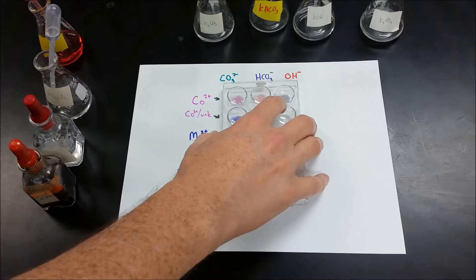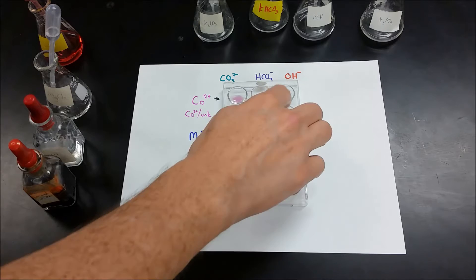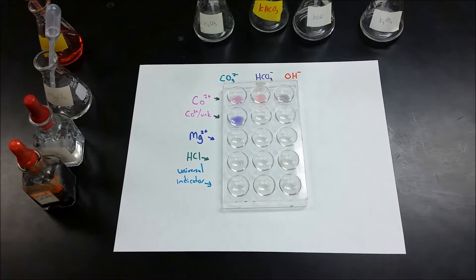So the hydroxide gives a certain color precipitate. Our unknown is different from that, and it's also different from the bicarbonate and the carbonate.